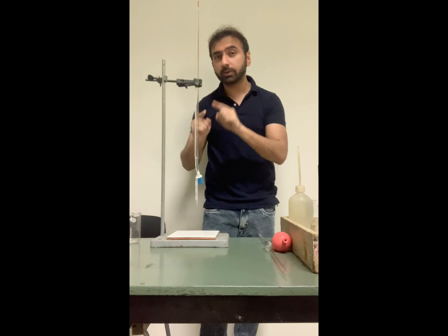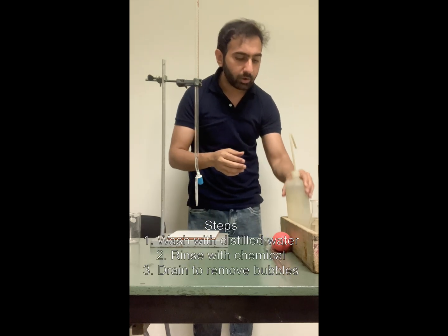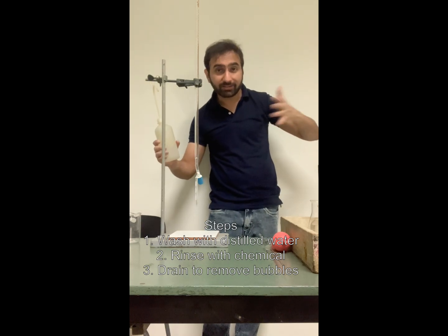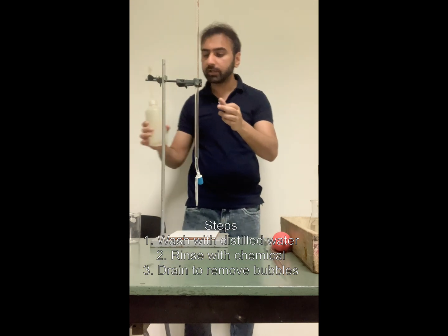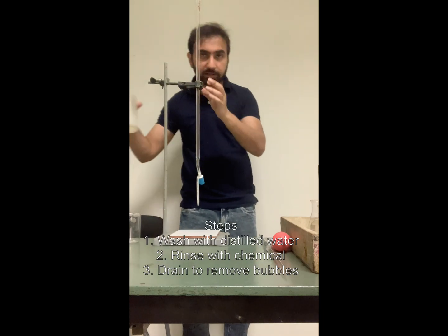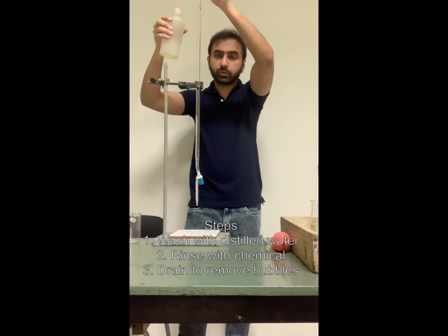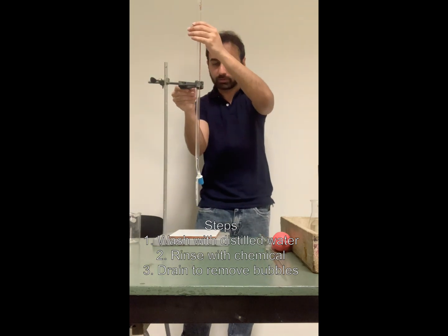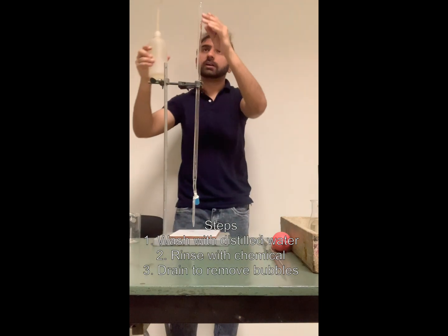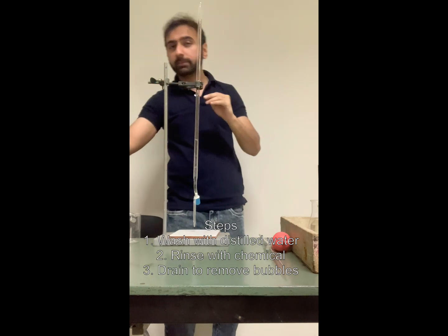When you want to fill your burette, the first thing you do is wash it with distilled water. I've got distilled water with me. When you have a sink available it's easier to wash it, but right now what I am doing is I will be filling my burette with distilled water from the top. So what I just do is fill my burette with distilled water. I will be trying to show you three important things, so I will be bringing the burette closer to you.